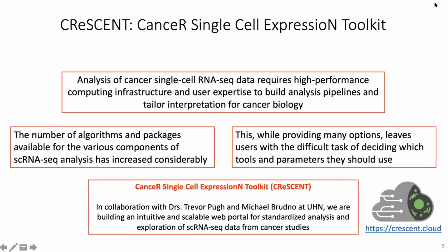In collaboration with Dr. Pugh and Dr. Brudno at University Health Network, we are building an intuitive and scalable web portal for the standardized analysis and exploration of single-cell RNA-seq data from cancer studies. The project is called Crescent.